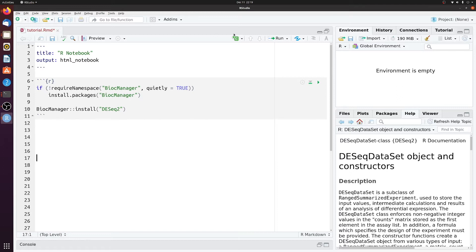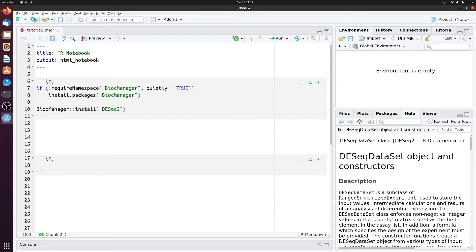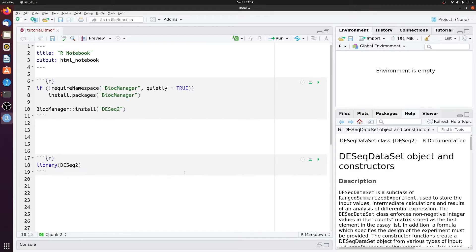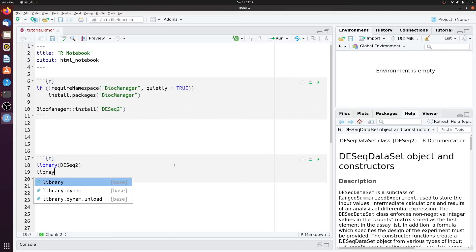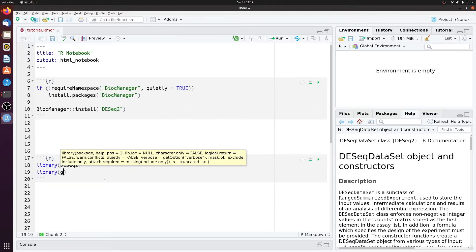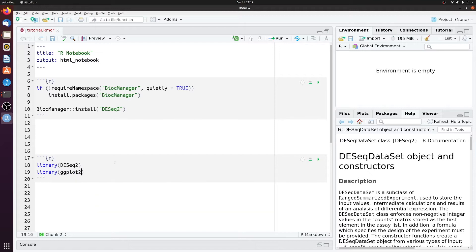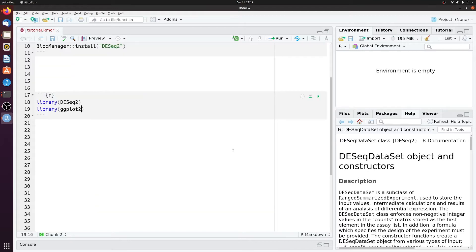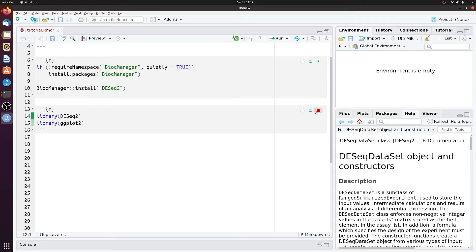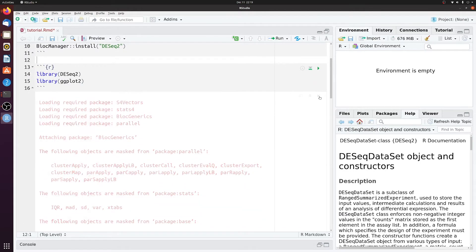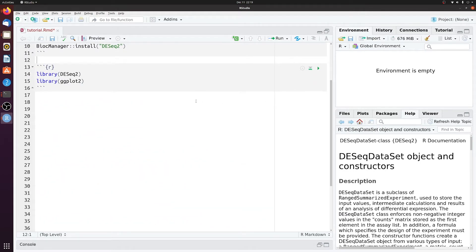Then we need to load DESeq2. So we can just say library DESeq2. And then later, we're also going to need something called ggplot2. So we'll load both of these modules. Get rid of some of these spaces. And then you can just clear this.